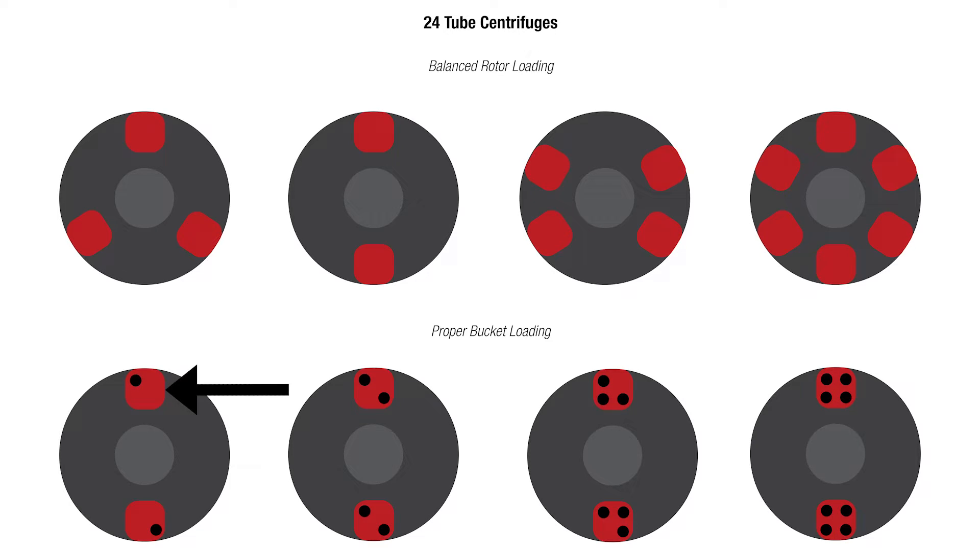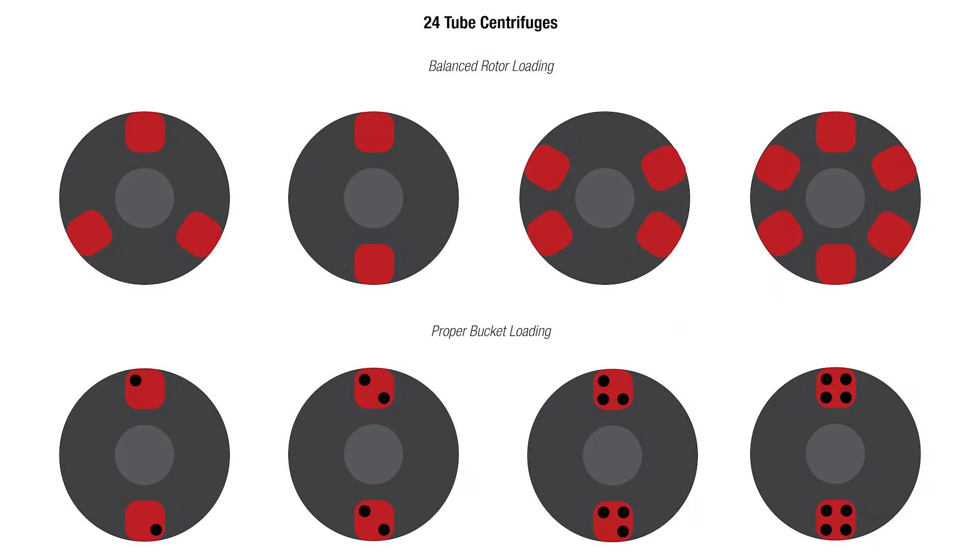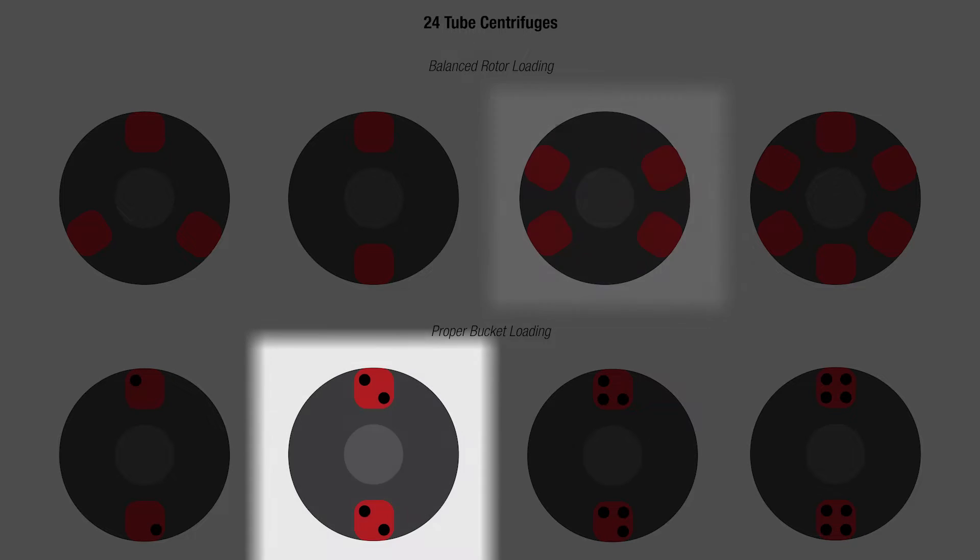Red indicates an equivalently filled tube holder. Now, what happens if you're running different tube sizes — say, 4 ml and 10 ml tubes? You can absolutely run them in the same spin. Just make sure to follow the equivalent size and fill volume rule. If you've got two 4 ml and two 10 ml in one tube holder, you'll need two 4 ml and two 10 ml in the other matching tube holder. Alternatively, you could load these tubes into four tube holders instead of two — placing two 4 ml across from the other two 4 ml, and two 10 ml across from the other two 10 ml.